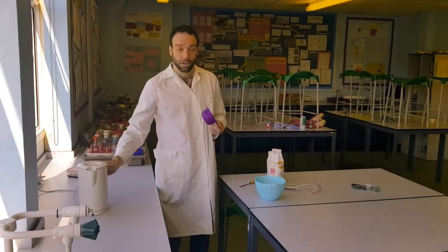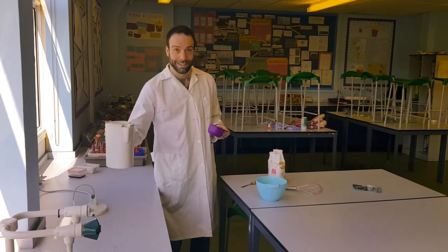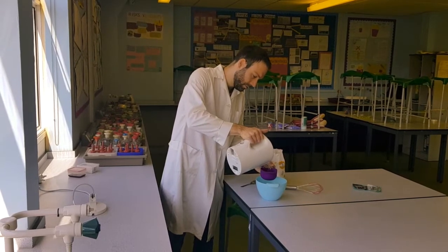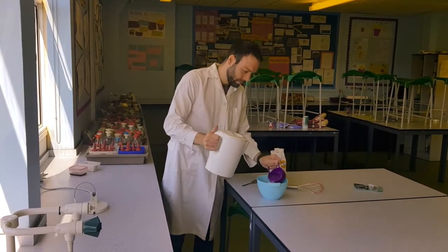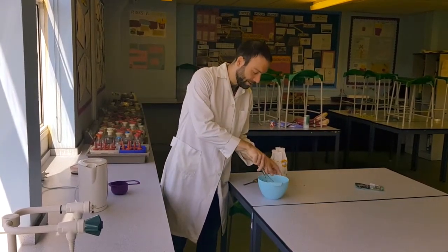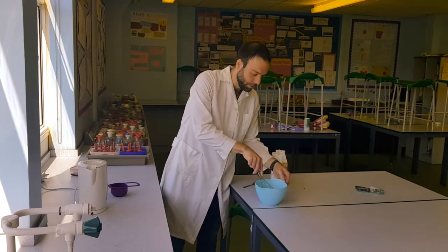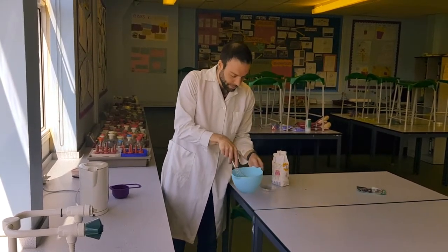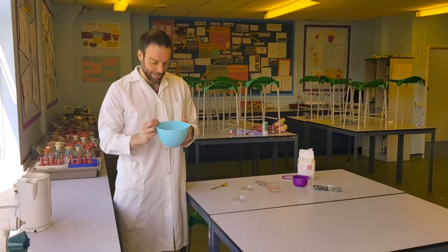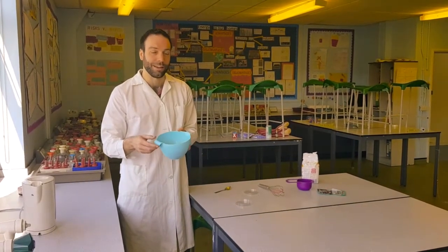The amount of water I'm going to use is one cup, or 250 millilitres, of boiling water — so be careful and have an adult help you. Pour the boiling water in and give it a really good mix to make sure that all the gelatin dissolves, along with the stock cube and sugar. You'll end up with a lovely brown liquid solution that's got all the stuff bacteria need to grow.